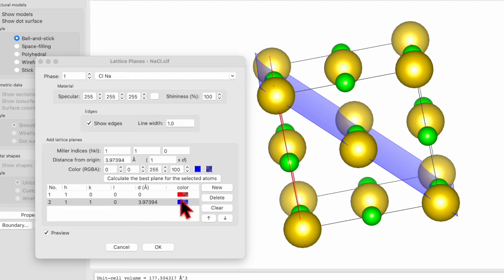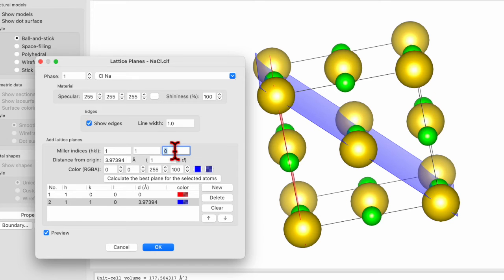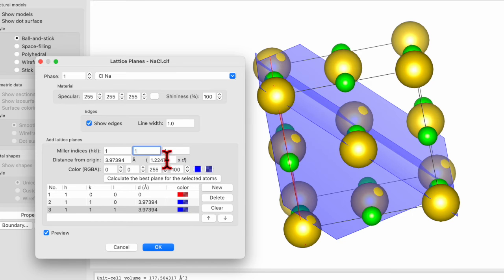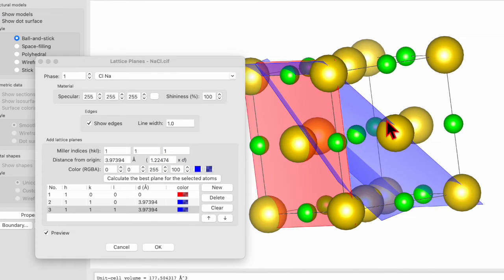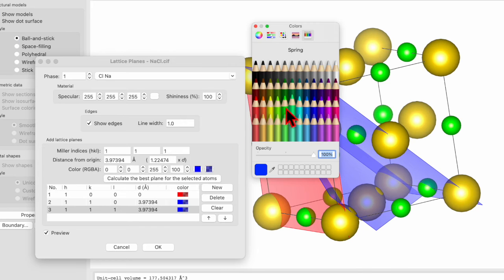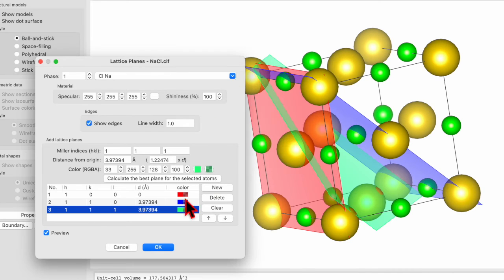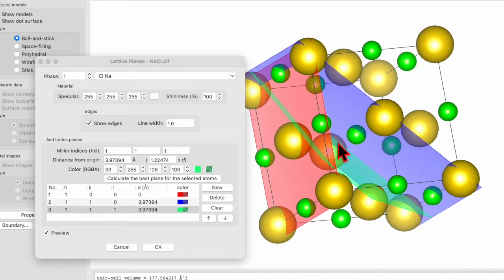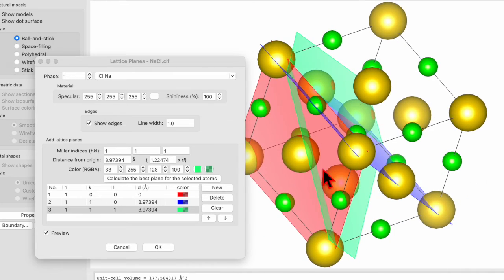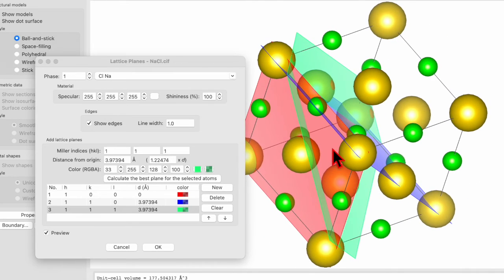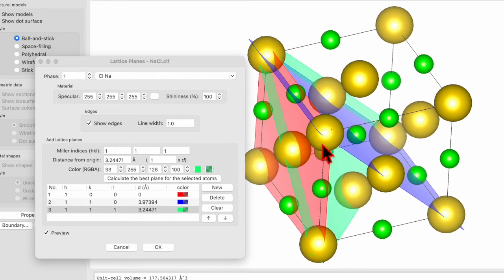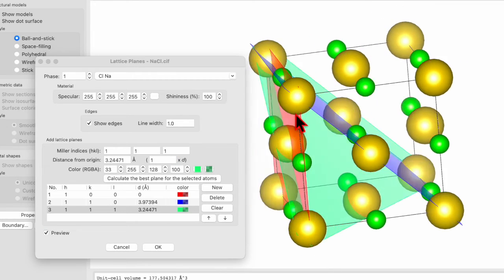Okay, now let's see a new plane. Click on New and change it to 1-1-1. So this is a new plane and I will give it a different color. Let's select a green color. Okay, so I want d equal to one. Perfect.